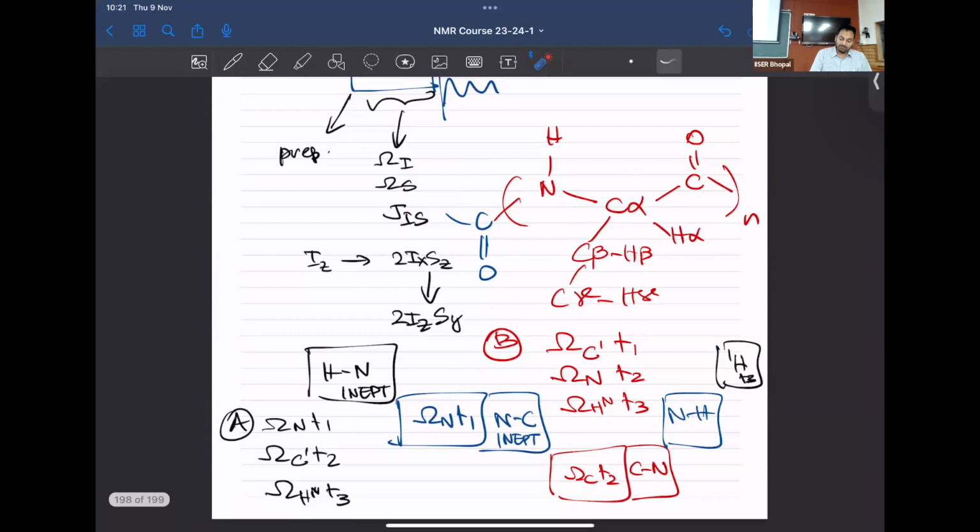Okay, so the carbonyl, since it doesn't have many features, is also not going to have a very good chemical shift resolution, right? Because the peaks are going to be more crowded on top of each other. So it's also a smart thing to invest in the higher resolution on carbon in this experiment than on nitrogen. Does that make sense?